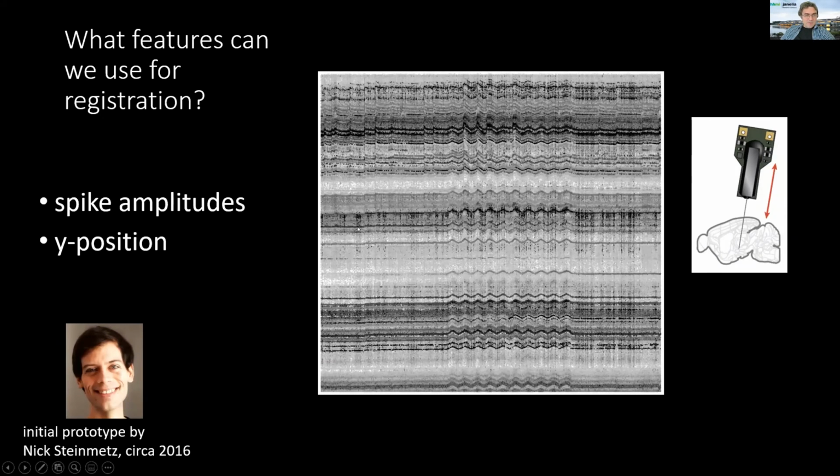Do we have a name for these plots? These are some kind of spike depth raster, maybe density plot. All right. Yeah. It's right. So this is showing a really long period of time. Every dot here is a spike, and it's been colored by its amplitude. And these were just detected without any kind of spike sorting, just detecting spikes based on some canonical templates that we set up a priori.